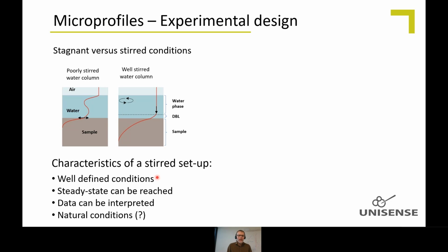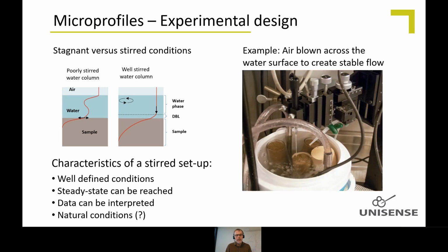This will create well-defined conditions, and you get steady state, and then data can be interpreted. That means that you can do a lot of calculations on them that actually require steady state. An example of this could be here.